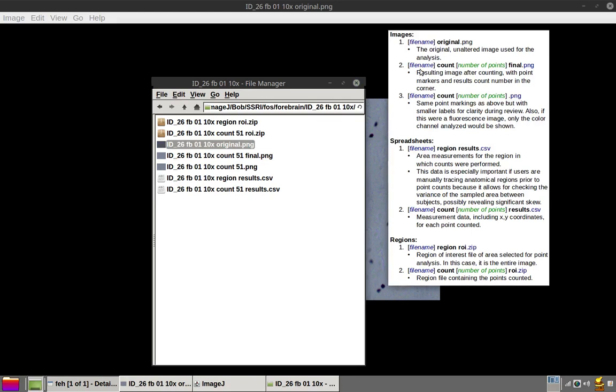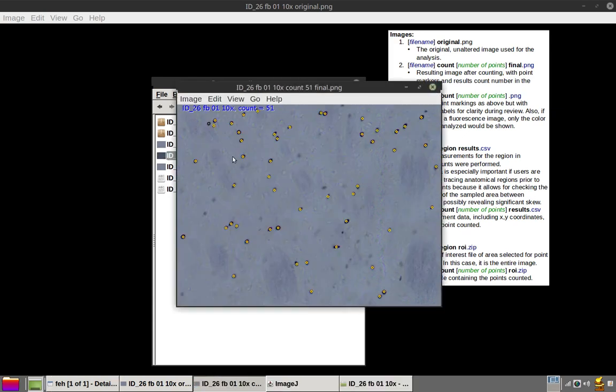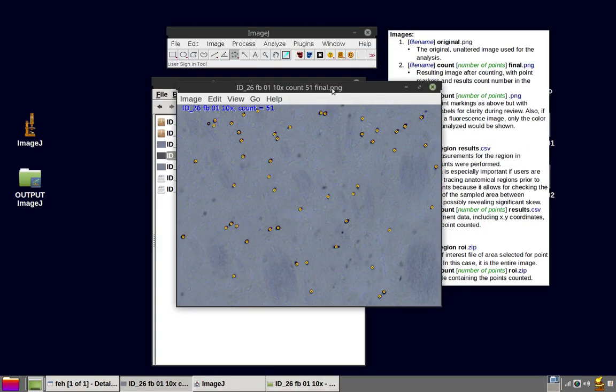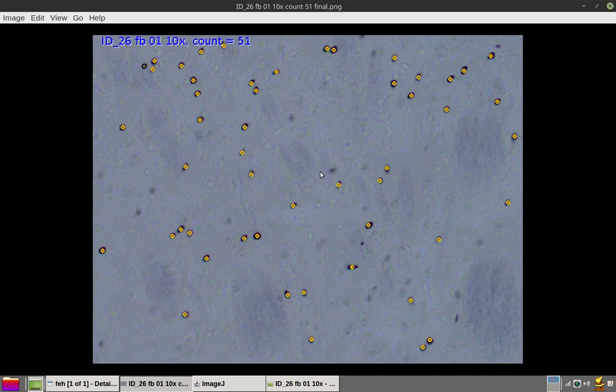Next is the file name with the word count. Then the number of points, which is our result. Followed by the word final. That's the resulting image after counting, with point markers and result count number in the corner for convenient review. Let's take a look at that. That looks familiar. That's the image that we saw as the final step of our analysis.